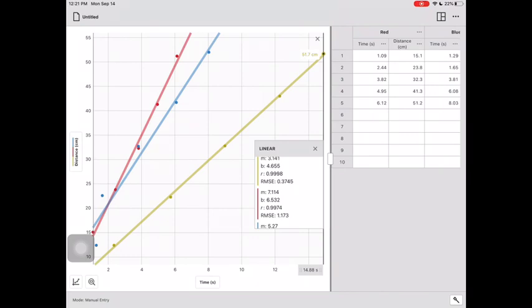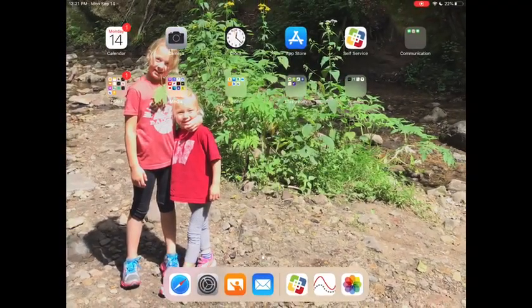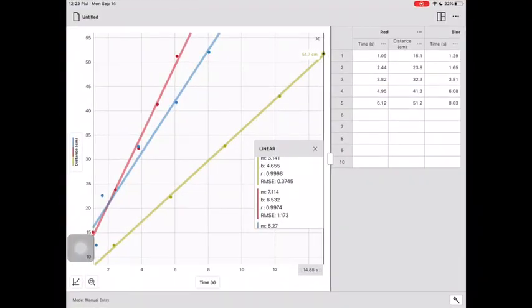The very last thing you'll want to do on here is take a screenshot so you can save your data so that you have that available when you go back and look at your lab and answer those questions. You might want to make sure that when you take a screenshot, you do have the m's visible as much as possible for all 3 lines. And there's a screenshot. And then we are all set with that part.